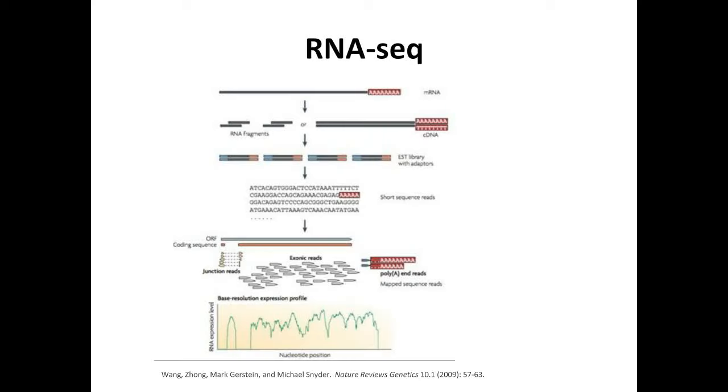I would like to first talk about the conventional RNA-seq method. Those of you who are familiar know that we first isolate and purify mRNA, and then synthesize cDNA using protocols provided by the companies. These cDNA libraries are used to make small fragments of DNA.